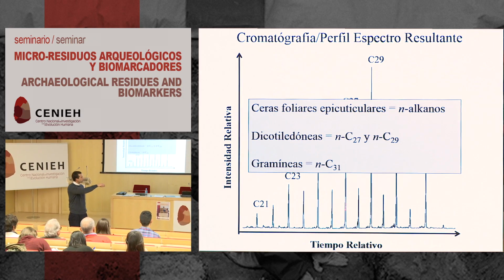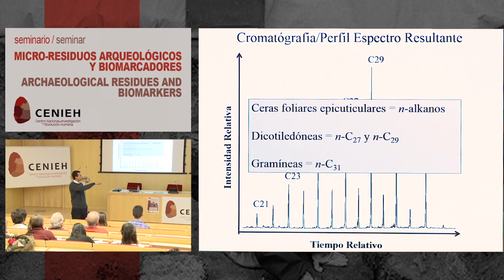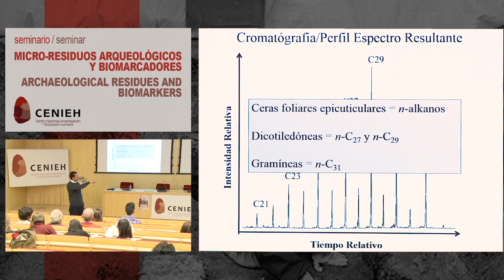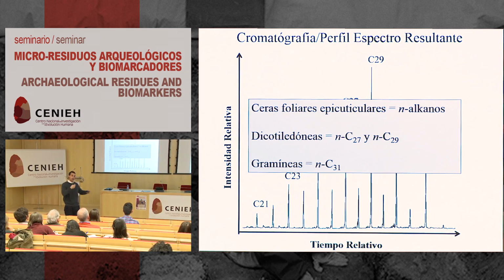Well, anyway, so our abundance here, and this is through time. As you see, the heavier elements, I'm sorry, this is blocking the way, but the heavier elements are separated out later because they are heavier than the earlier stuff. And that's really how we quantify what it is we're looking at, what our samples are showing.